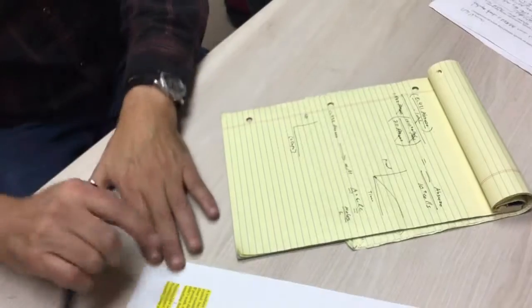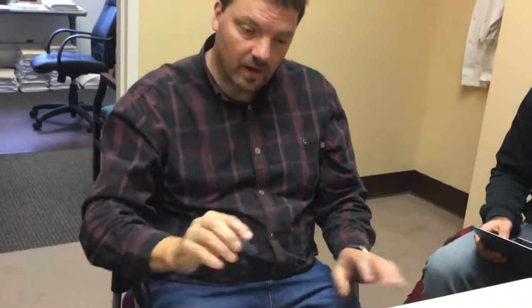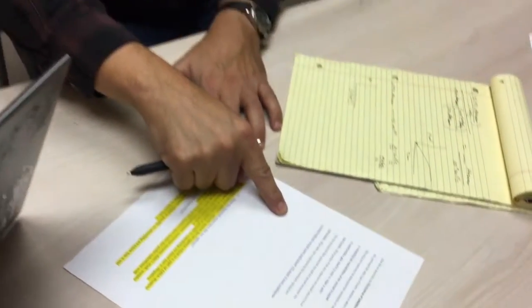Right? So in your experiment, you pipetted a volume of L-DOPA. So I had to give you the concentration of the L-DOPA for you to figure out what its concentration was after you put it into the cuvette, right? Right, and that's what this column is giving us. It's giving us the concentration of the substrate.